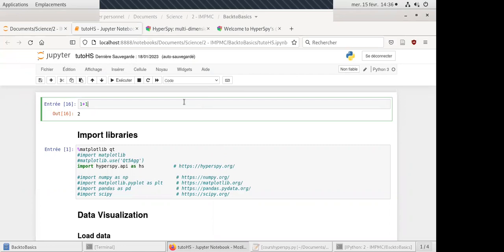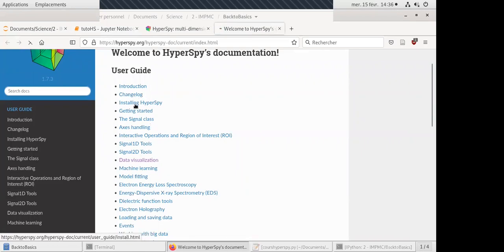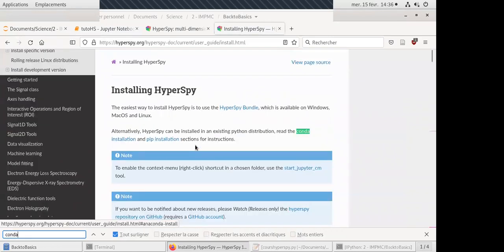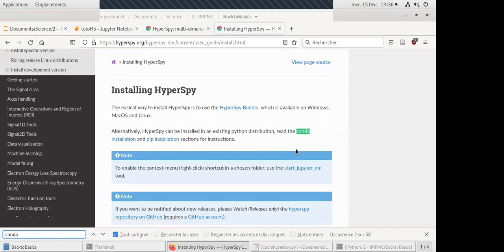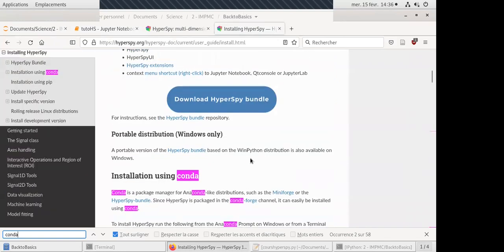To install Python and all its dependencies, a great way to do that is to use the Anaconda distribution. There is a lot of documentation for this. For installing HyperSpy specifically, it's recommended to go through conda — it's very well explained depending on whether you're on Windows, Mac, or Linux.